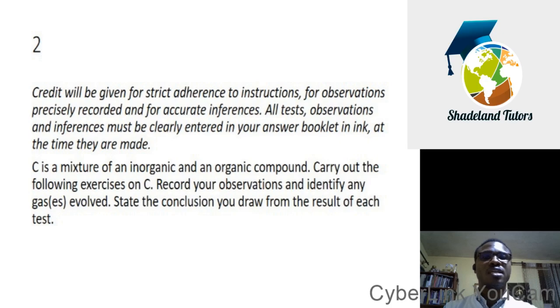So real quick, C for this exam. C is a sample of an inorganic and an organic compound. Carry out the following exercises on C, record your observations, and identify any gas or gases evolved. State the conclusion you draw from the result of each test.